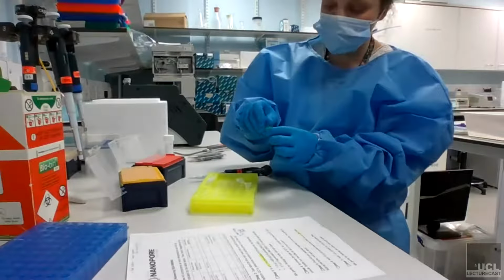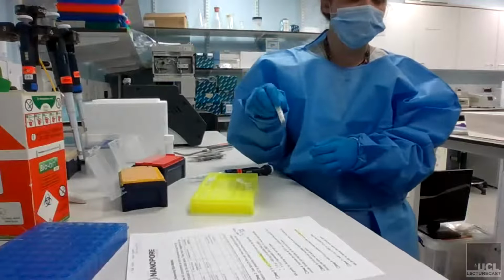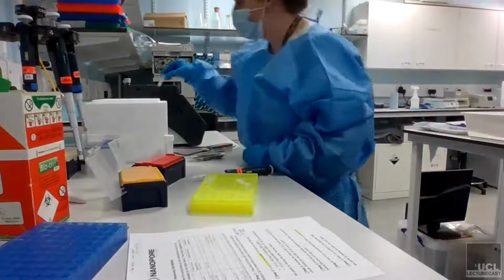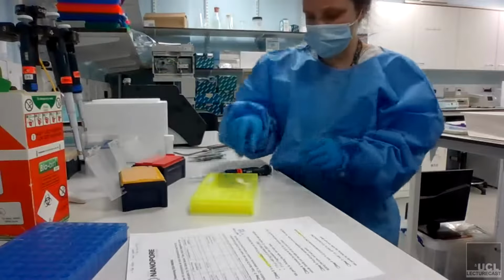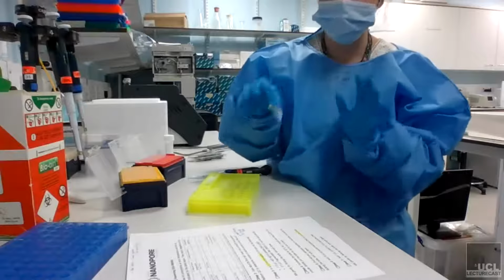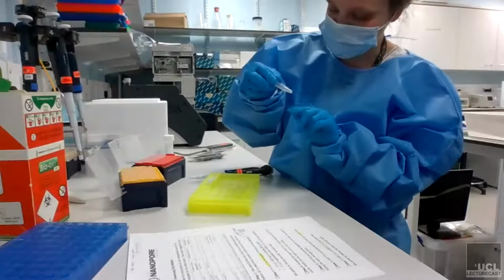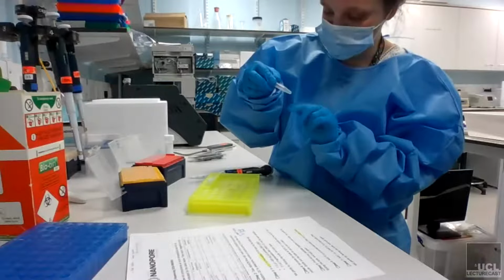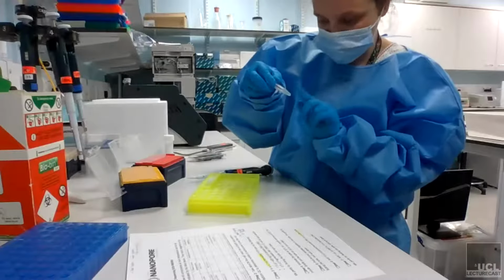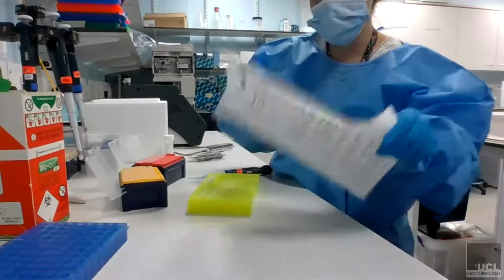This is often the thing that goes quickest. I think you can buy rapid adapters separately, but you should probably check that. You'll find that the rapid adapter is the most precious thing, so look after it, because that's the thing that you'll use most of, or quickest. I'm going to give that a gentle flick to mix it all together.